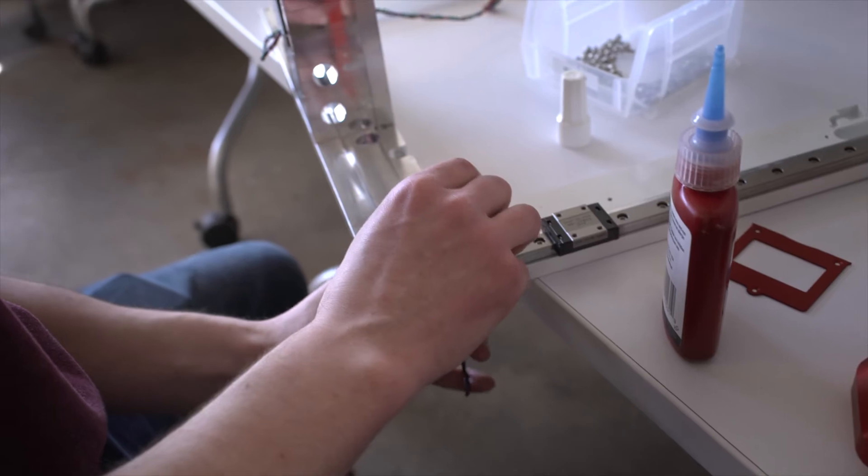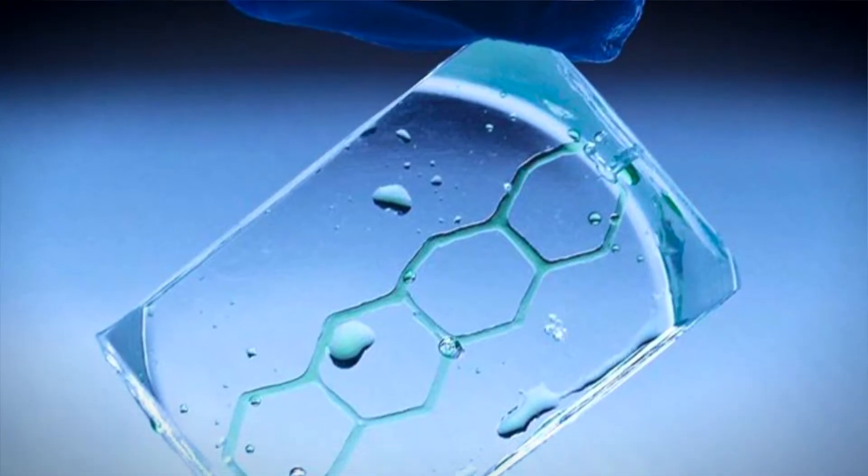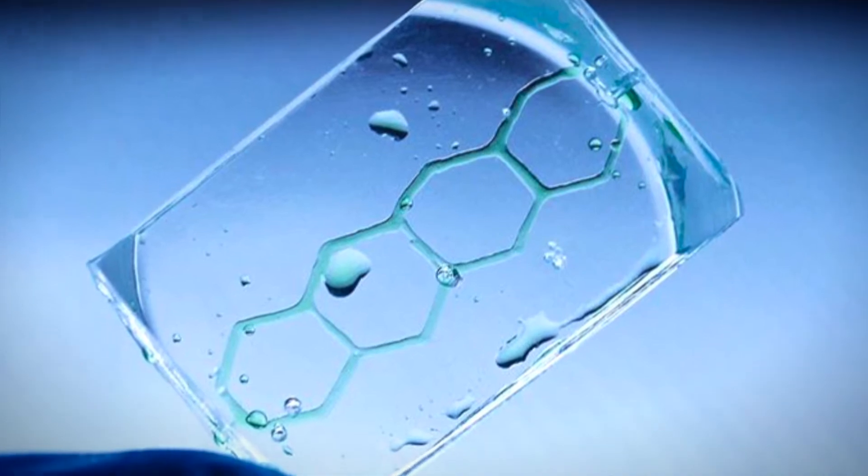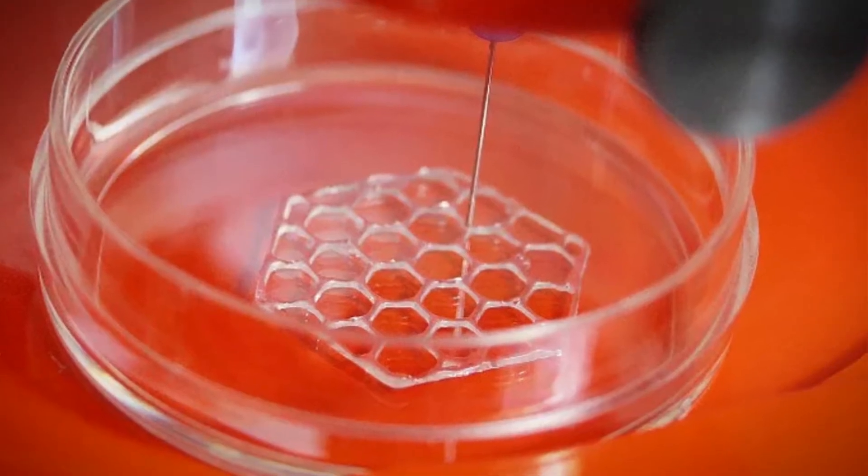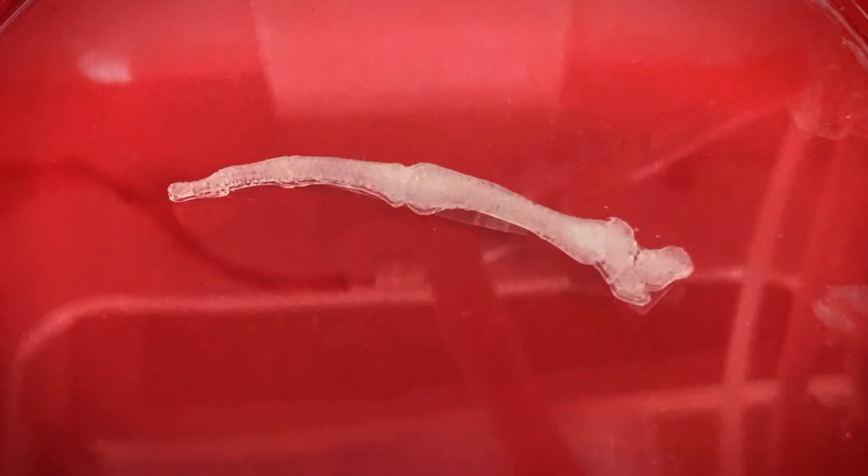In the Allevi world, there's two types of things that we mostly work on. The microstructures, which is really replicating the microbiology—the straight lines, the circles, the dots, the squares—and then there's the macrostructures.